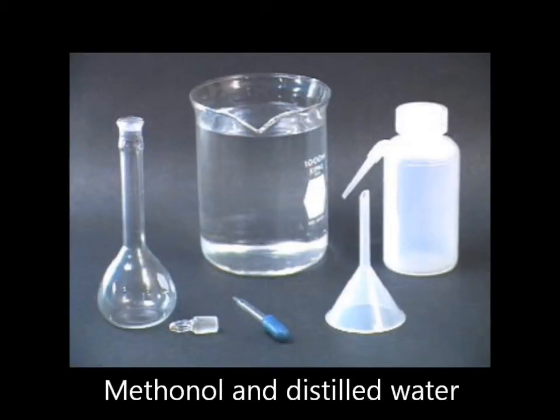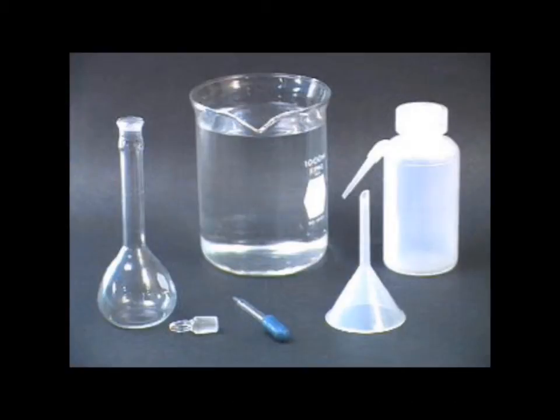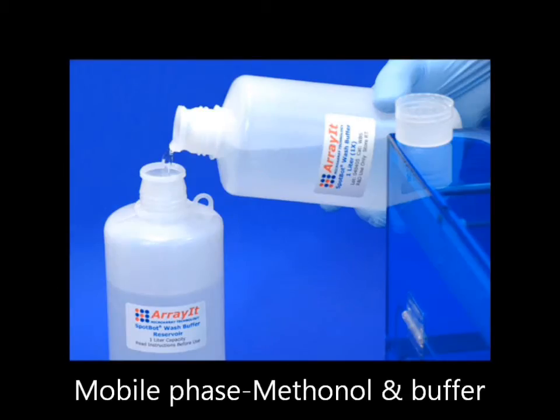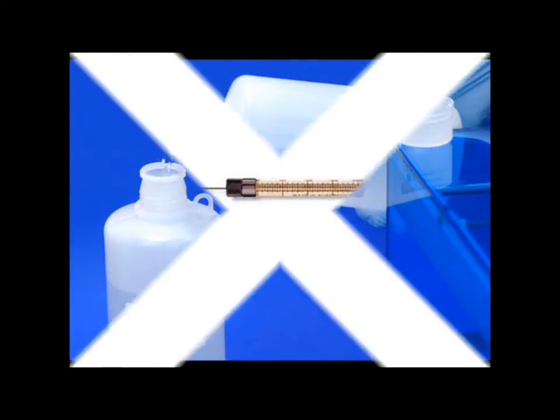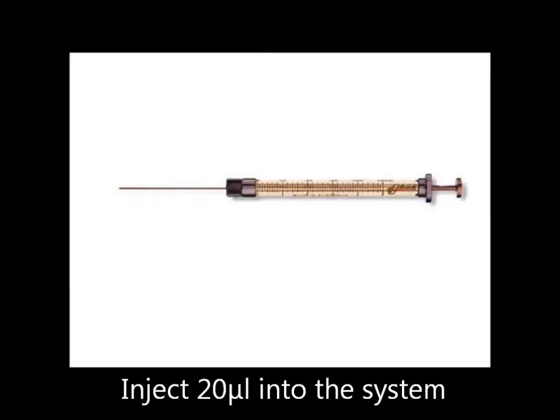The first step of the procedure is to flush the column with methanol for 15 minutes. The second step is to wash the column with distilled water for 15 minutes. The third step is to equilibrate the column with mobile phase consisting of equal parts methanol and buffer till the baseline is stabilized.